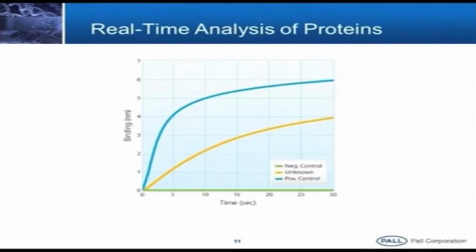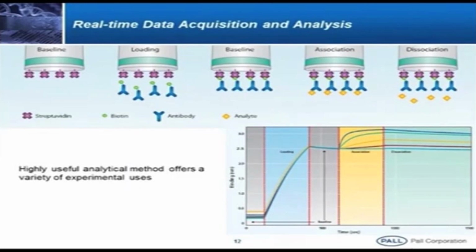So this is what the readout is, how it comes, the example I had shown. Kinetics actually, how we are performing this kinetics.